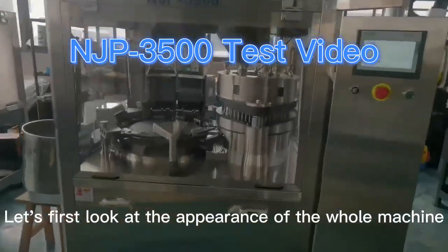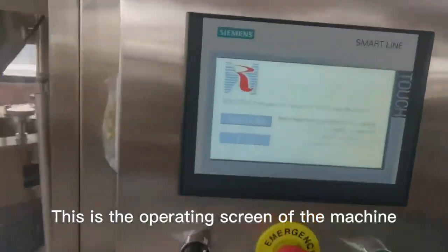Let's first look at the appearance of the whole machine. This is the operating screen of the machine.